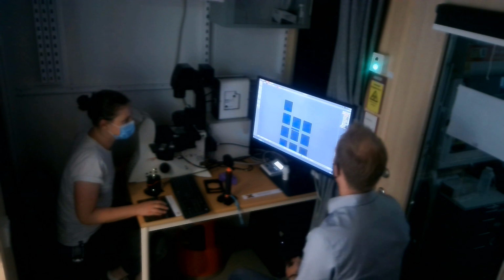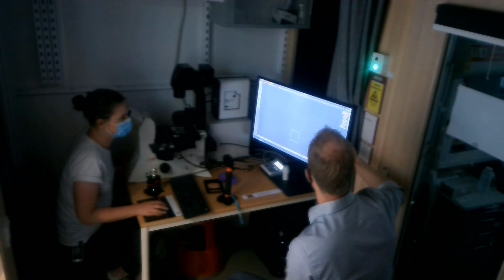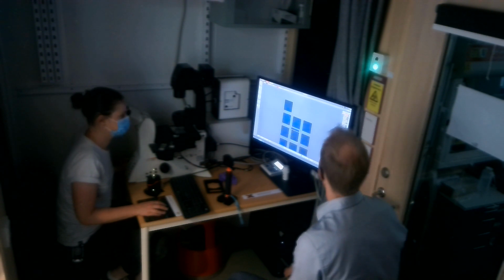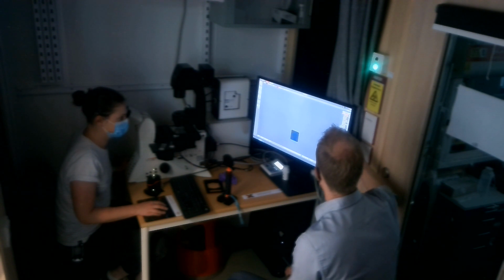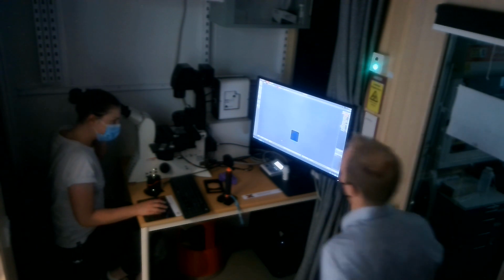So now what you can do, if you want to get rid, you can also click on the mother there to get rid of all the old ones, and if you do that there too, the one before. Okay. And here now, if you don't have anything, you won't see anything. If you click on that little arrow there, here you see the individual previews. So if you click, you can even take away that last 10 ones. You can even click on the little X there, then you remove those completely. Okay. Now you can do a spiral scan there.